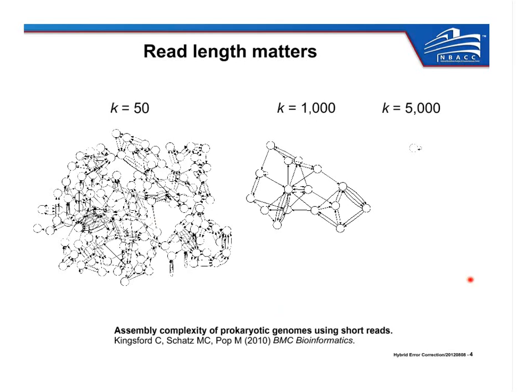As you increase the read length, though, the assembly graph simplifies itself. As the reads get longer and longer, the repeats that you're trying to detangle become less and less. By the time you get up to K5000, there are no repeats in the E. coli K12 genome that are larger than that length, and so your assembly through a typical overlap-based process comes out as a single contig. So all of the assemblers of the past decade have been well aware that read length is king in genome assembly.